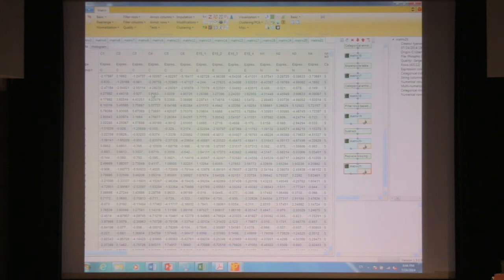I had a question. So this was intensity data. Would you do the same approach with SILAC ratios? No, and that's actually one of the nice things about using label-free for phospho, is that you can't impute ratios. So that's one of the things that we like about this workflow, is that missing values become less of a complete halt situation. You can deal with them, at least to some degree, more easily.